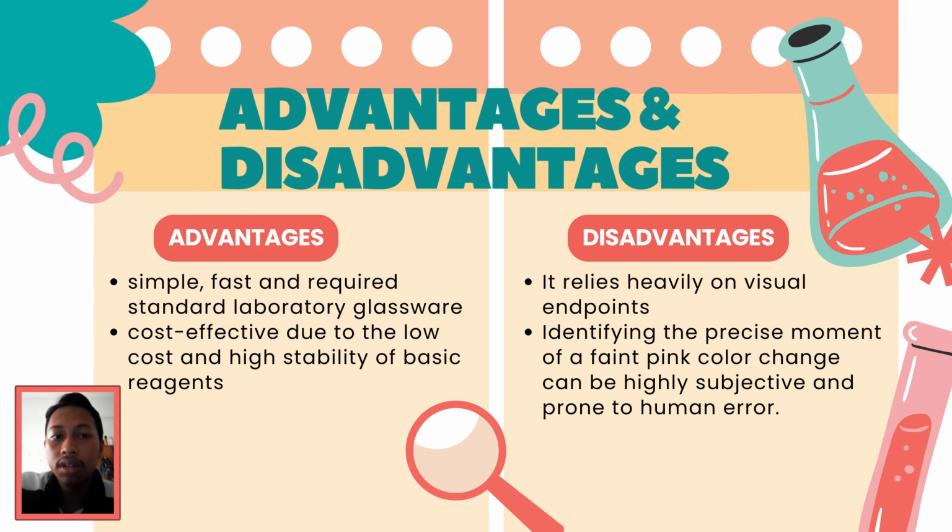On the operational side, this method is highly valued because it is simple, fast, and requires standard laboratory glassware rather than complex and specialized electronic instruments. It is exceptionally cost-effective due to the low cost and high stability of basic reagents like sodium hydroxide. However, the method possesses distinct limitations.